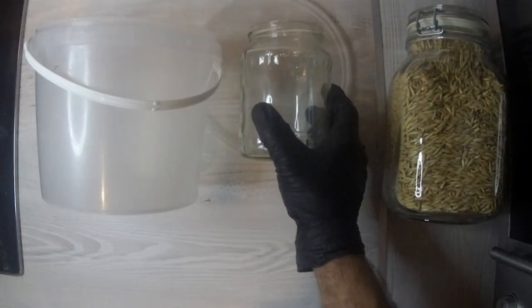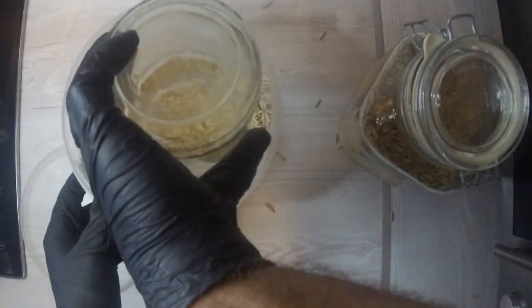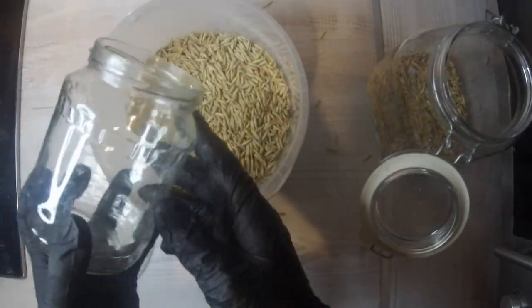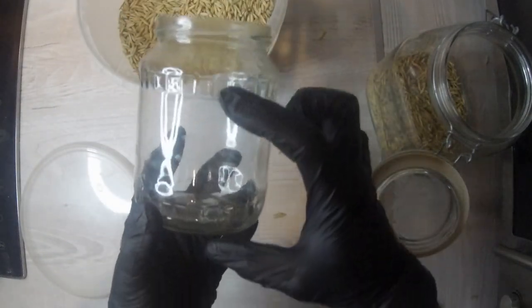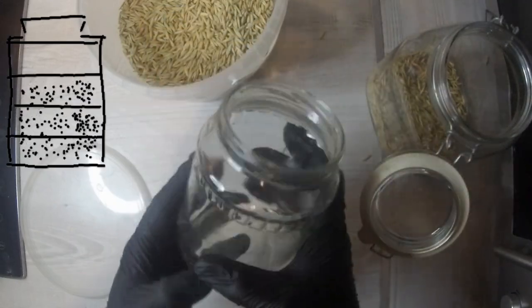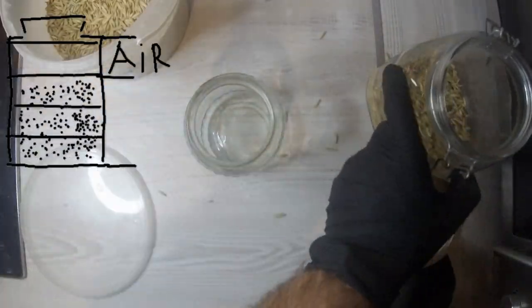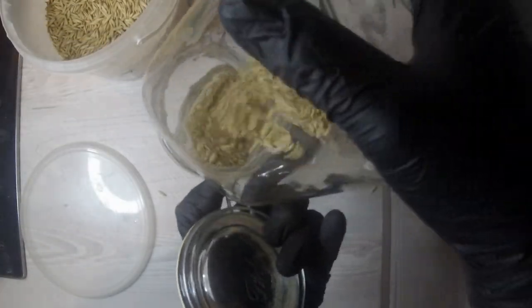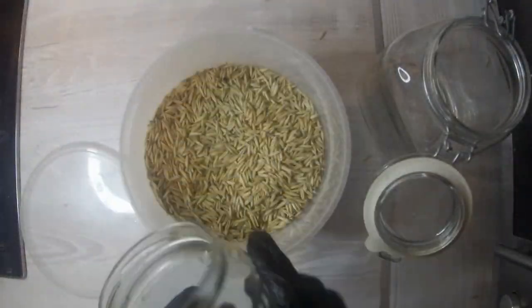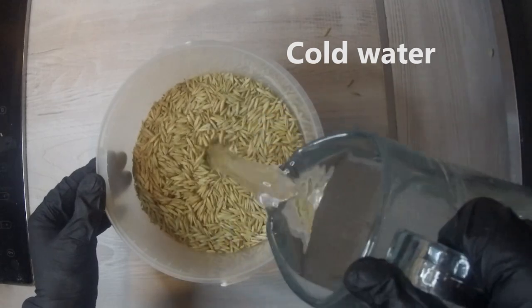Welcome back to Shrimp Academy. Today we're going to show you how to prepare grain, particularly woods, for mushroom cultivation. First we measure the necessary amount of grain so we don't prepare too much. We're going to fill the jar to three-quarters so it's not going to be very dense, otherwise the mycelium will be growing slower.